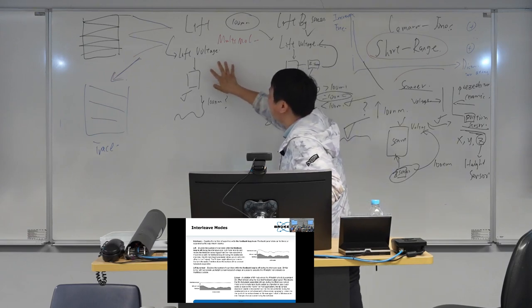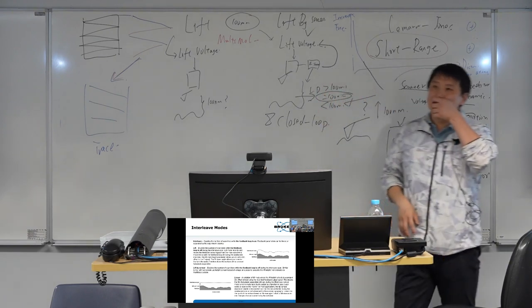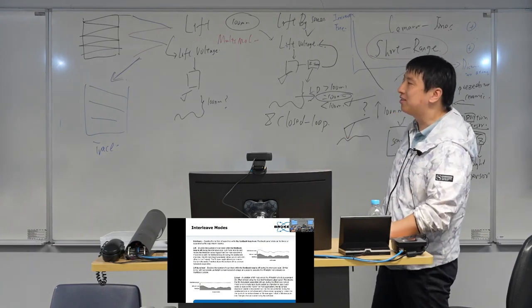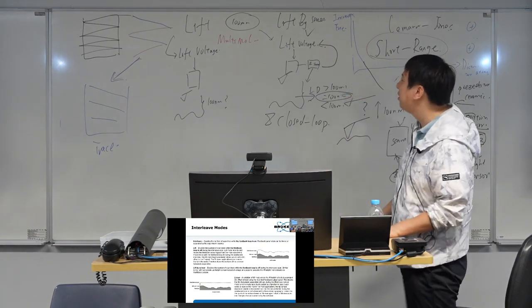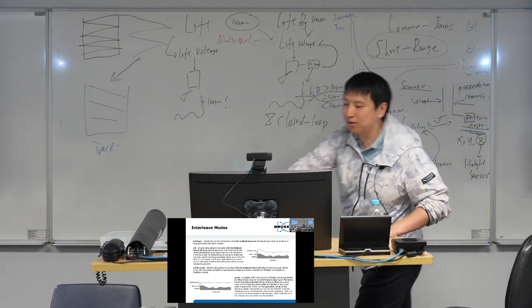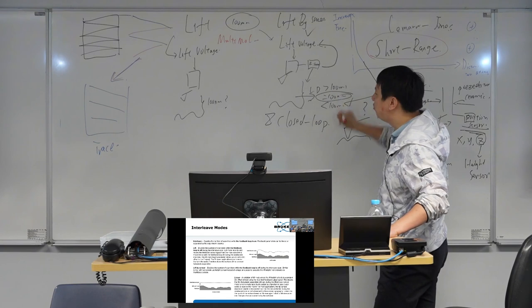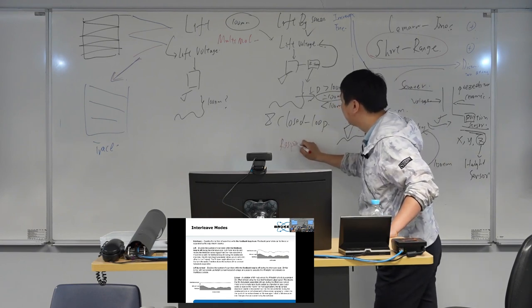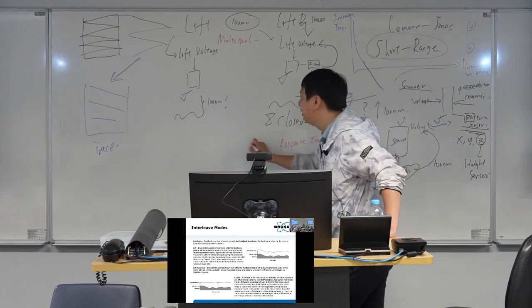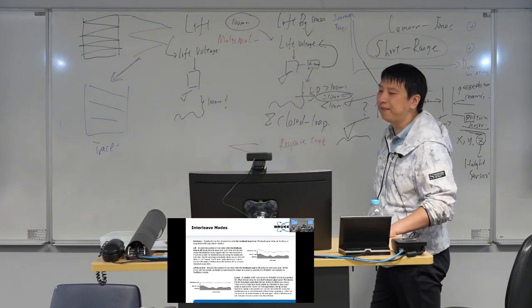Okay. The difference between the lift and the lift by sensor. We have some researchers, users, who are studying this kind of electric loops. You will know this setup is more complex, so you can tell the response time on this setup should be slower than this, but it's just slightly slower.